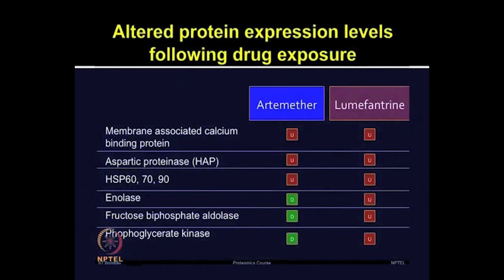Certain proteins were identified; few of those showed a common response to both drugs. However, certain proteins showed opposite trends due to each of these drugs.